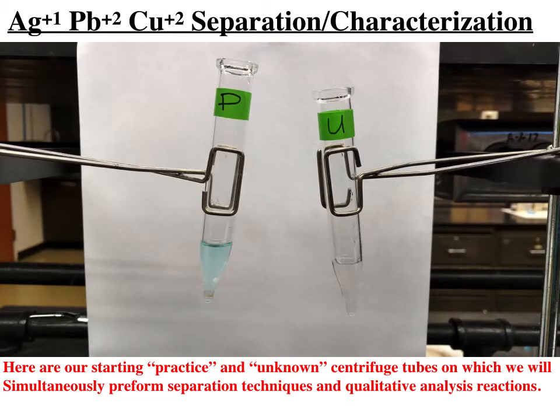So here's a picture of two of these so-called centrifuge tubes that I am holding with test tube holders. And these are the tubes that we will do the analysis on. You note one is marked P, that's for the practice tube. One is marked U, that's the one that contains maybe the ions, maybe all the ions, maybe only some of the ions present.